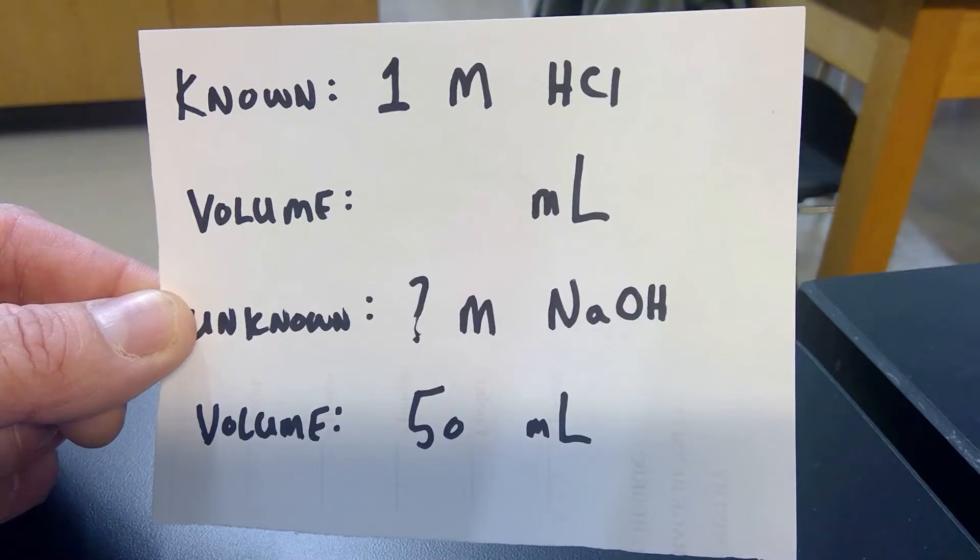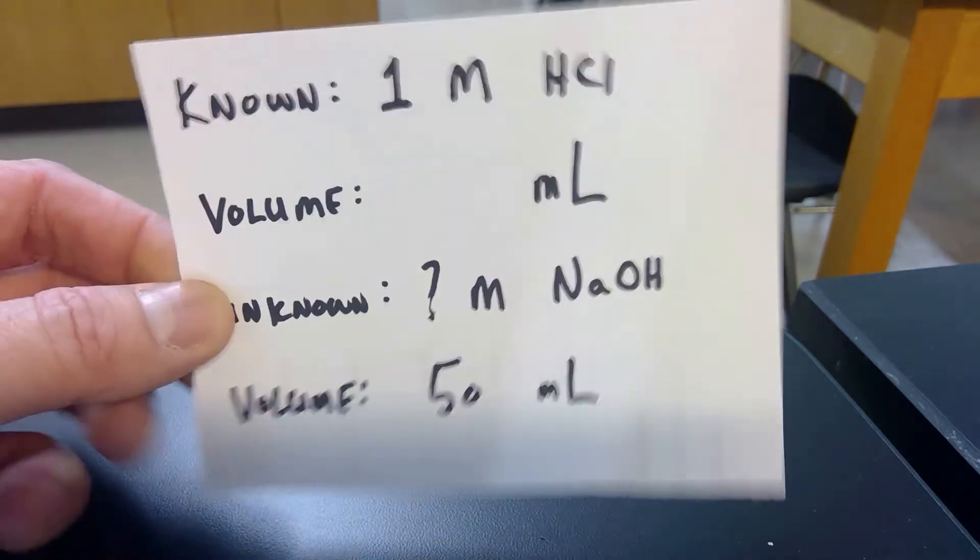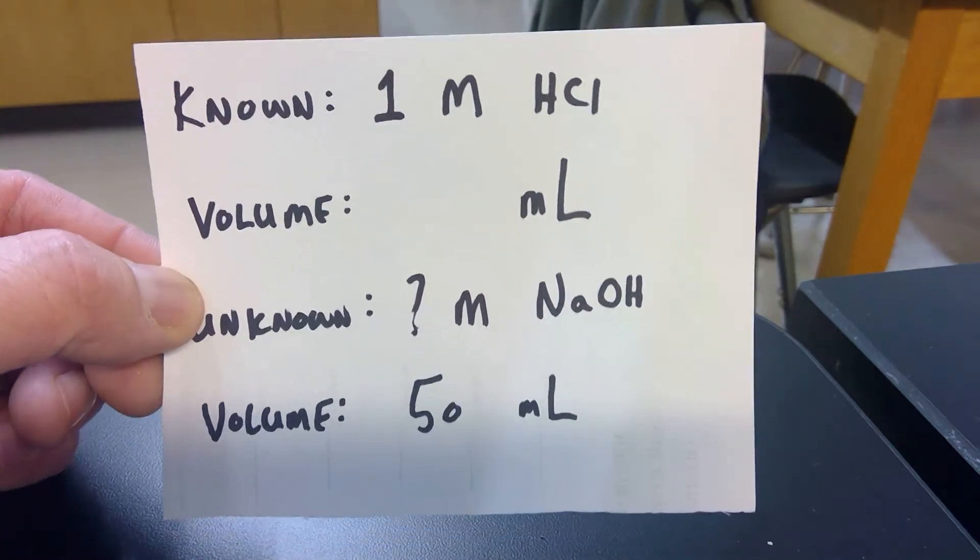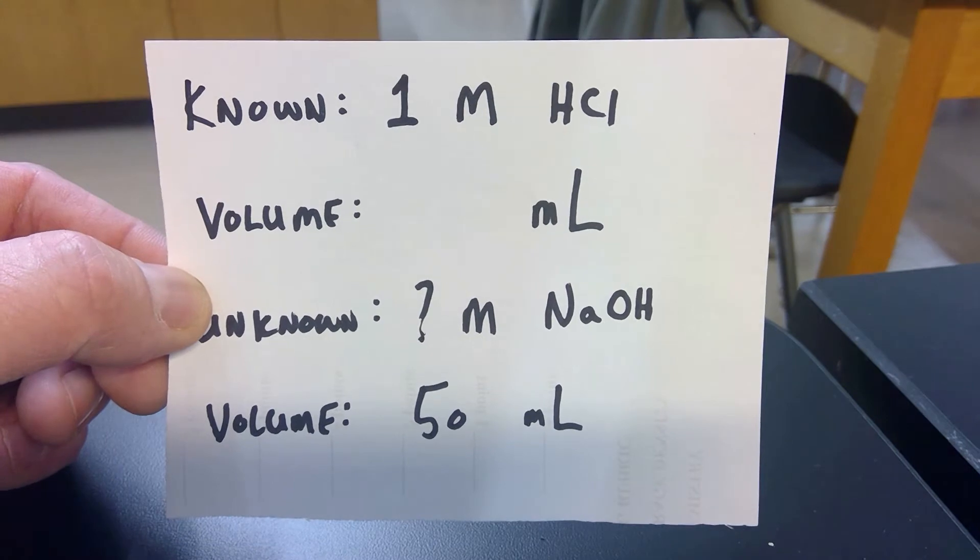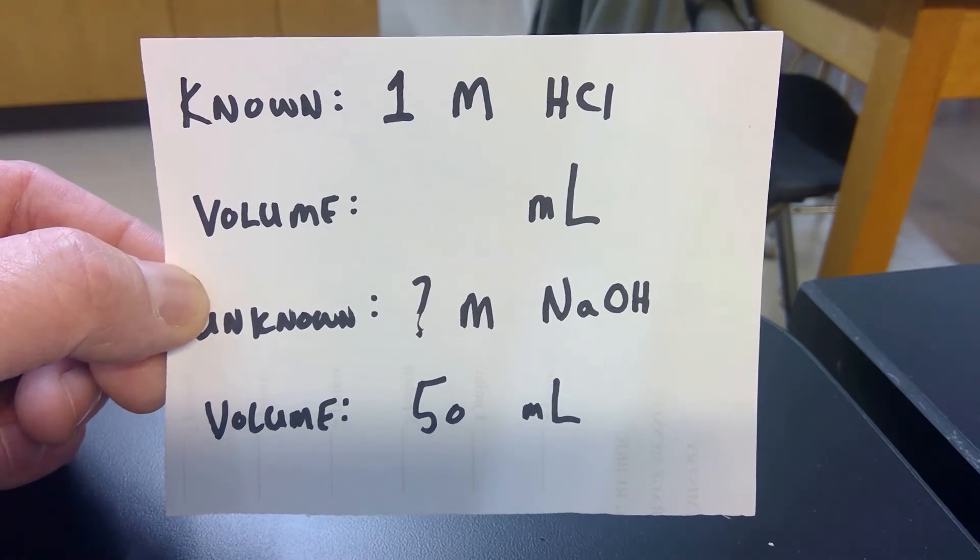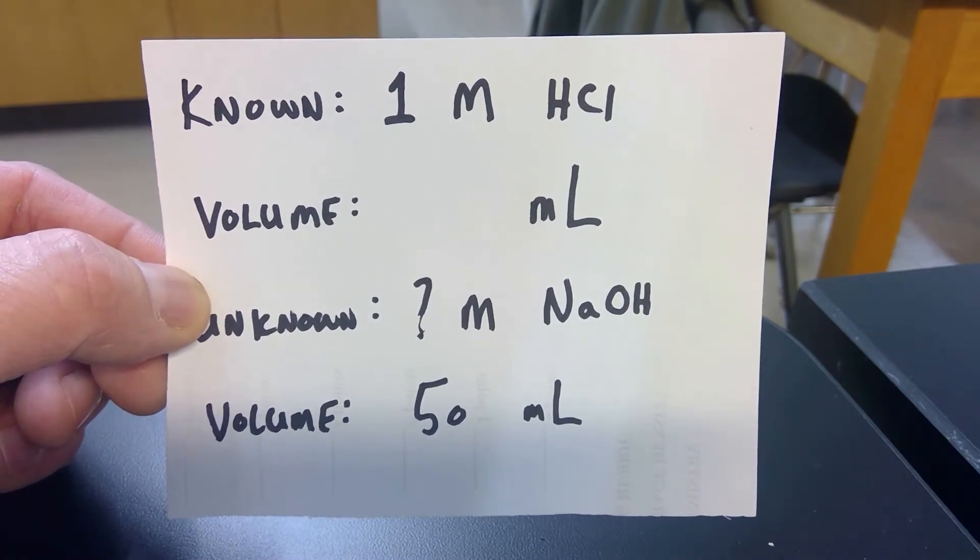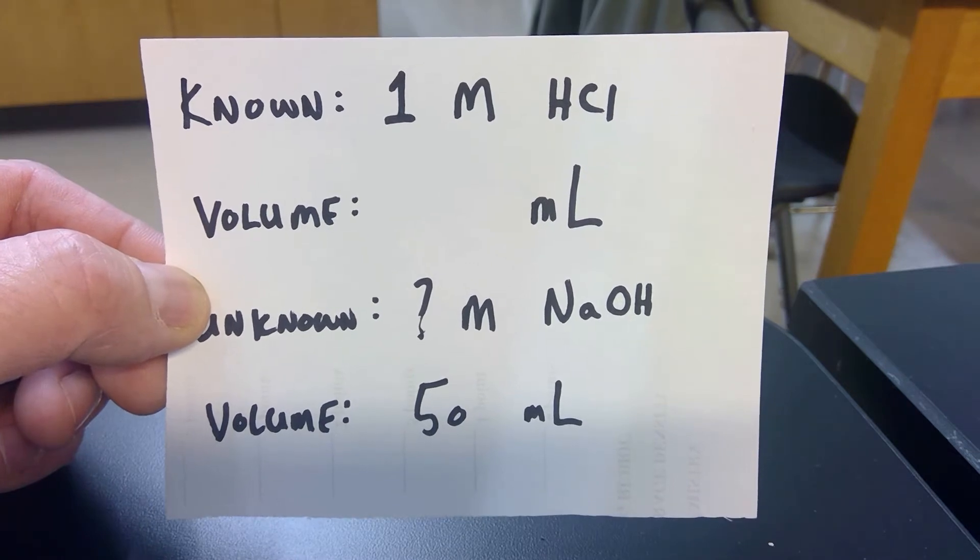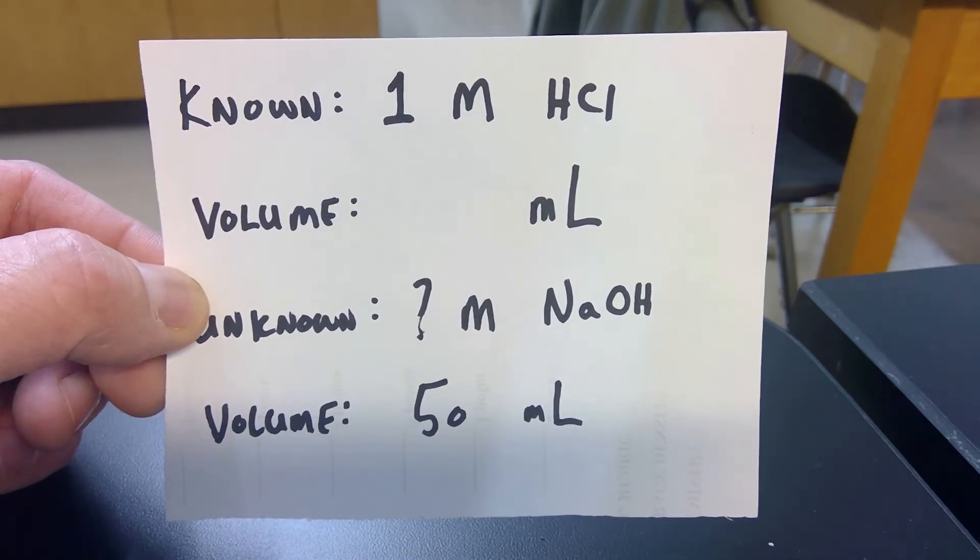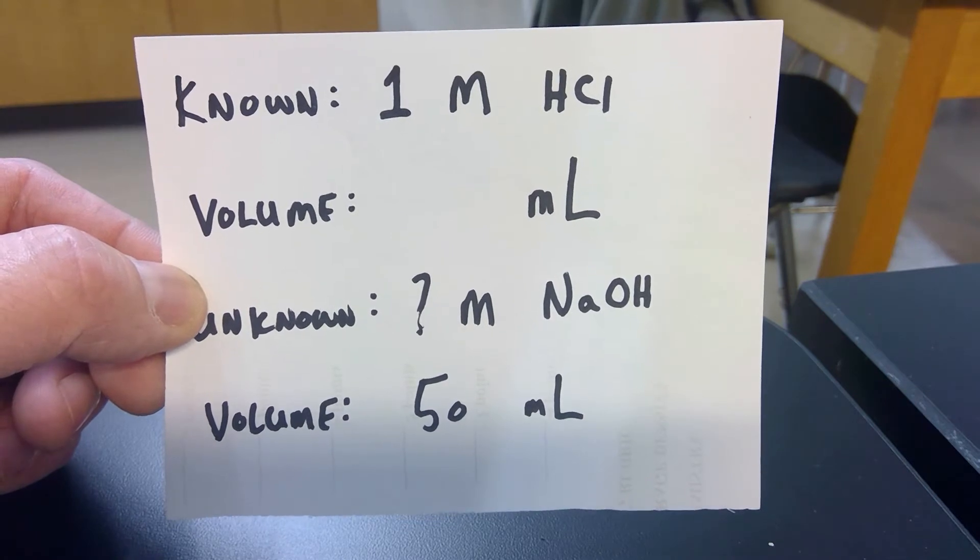So what I've done is I filled this burette with our known. Let's establish what we have. So here's what we know. We have 1 molar hydrochloric acid as our known. That's in the burette.